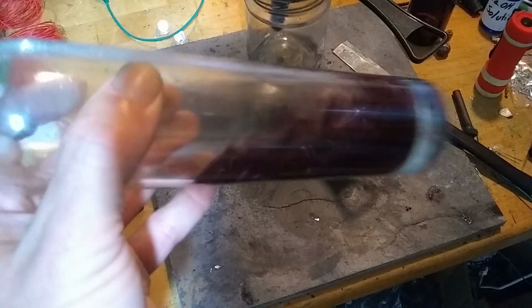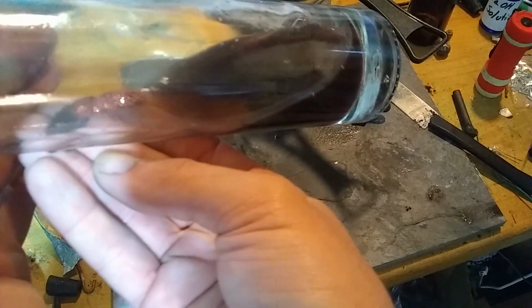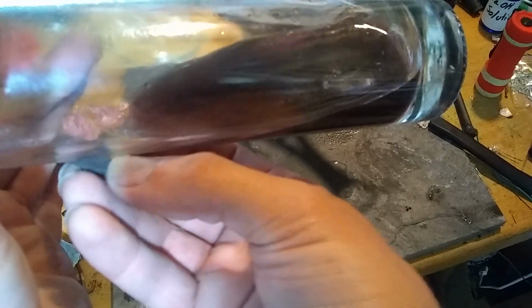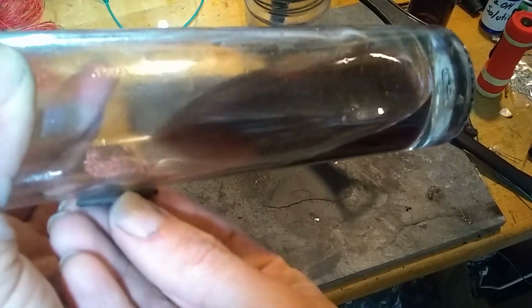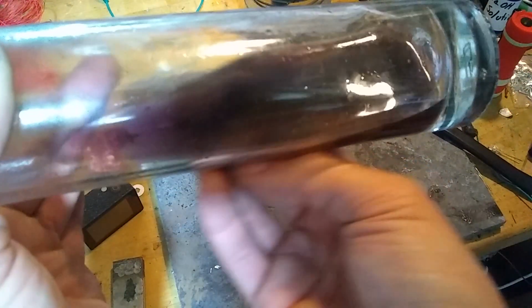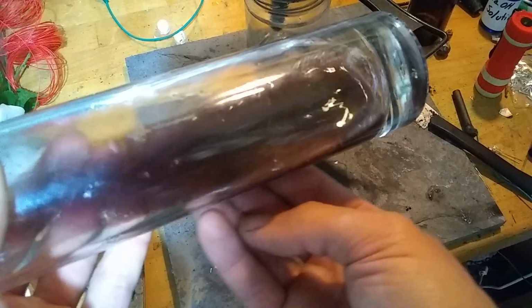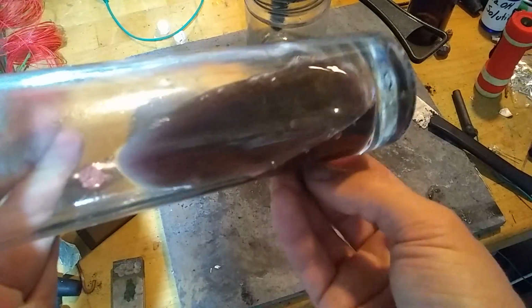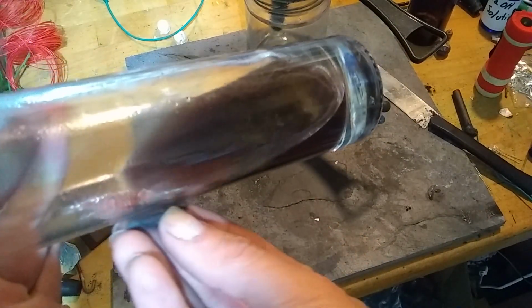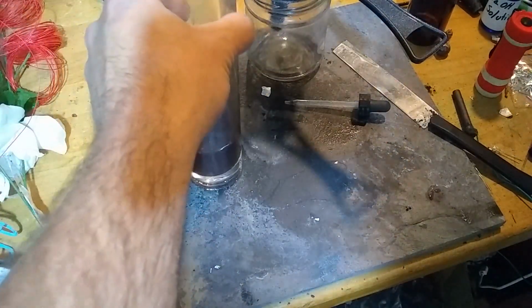This is something that was kind of neat that I thought I would show you, an intermediate stage in displacing the copper out of the solution. These pieces of metal are attracted to the magnet because they're pieces of cobalt with a thin layer of copper coating them. When they're fully reacted, it'll just be pure metallic copper, which won't stick to a magnet at all anymore. But in the meantime, you can drag bits of copper around with a magnet. Well, bits that look like copper.